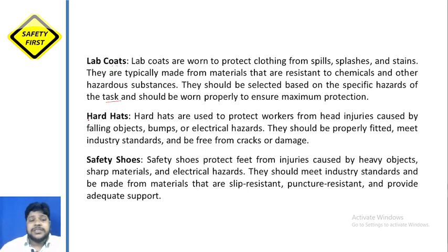हार्ड हैट्स. जैसे हम लोग हेलमेट की बात कर रहे थे उसी तरह का. जब हम कुछ ऐसा कर रहे हैं कुछ फॉलिंग ऑब्जेक्ट्स, बम्प्स, इलेक्ट्रिकल हजार्ड्स है तो वहाँ पे हमको कुछ होना चाहिए. ये प्रॉपरली फिट होना चाहिए. इंडस्ट्री का जो स्टैंडर्ड है उसको फॉलो करना चाहिए और पहले से टूटा फूटा ना हो.